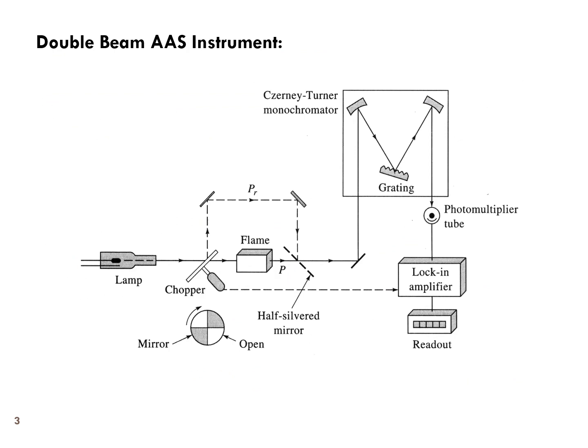Okay, this is the double beam instrument. Kalau kita tengok dalam single beam tadi, only one path of beam is involved. So, kita mesti measure the reference beam and sample beam differently. Tapi dalam double beam instruments ni, the beam daripada sini will be split into two.